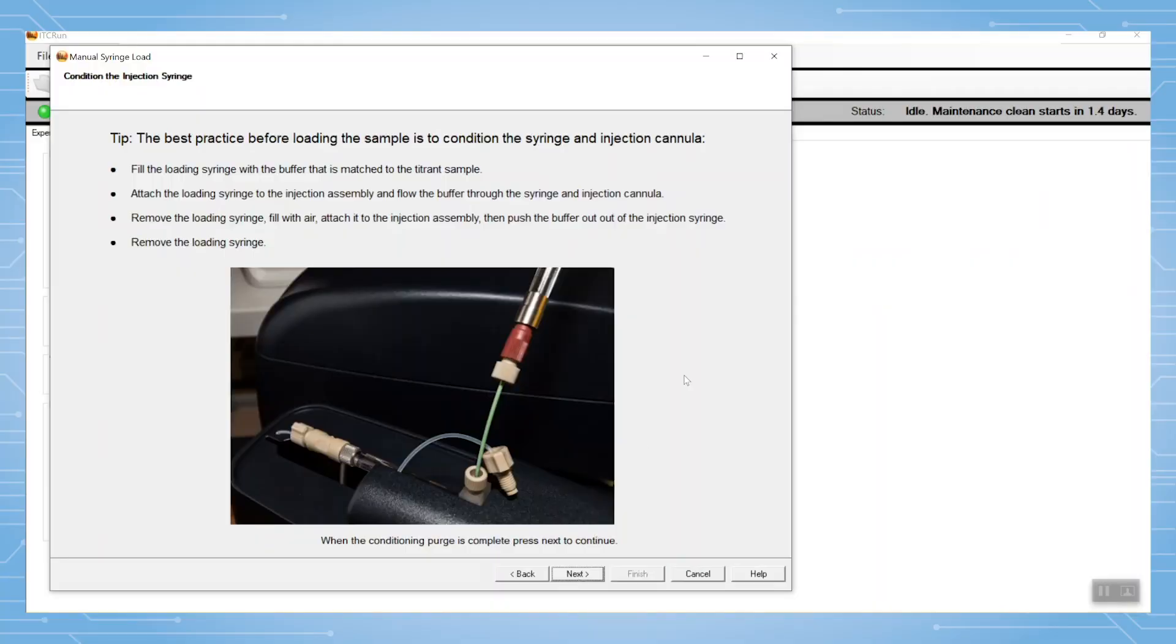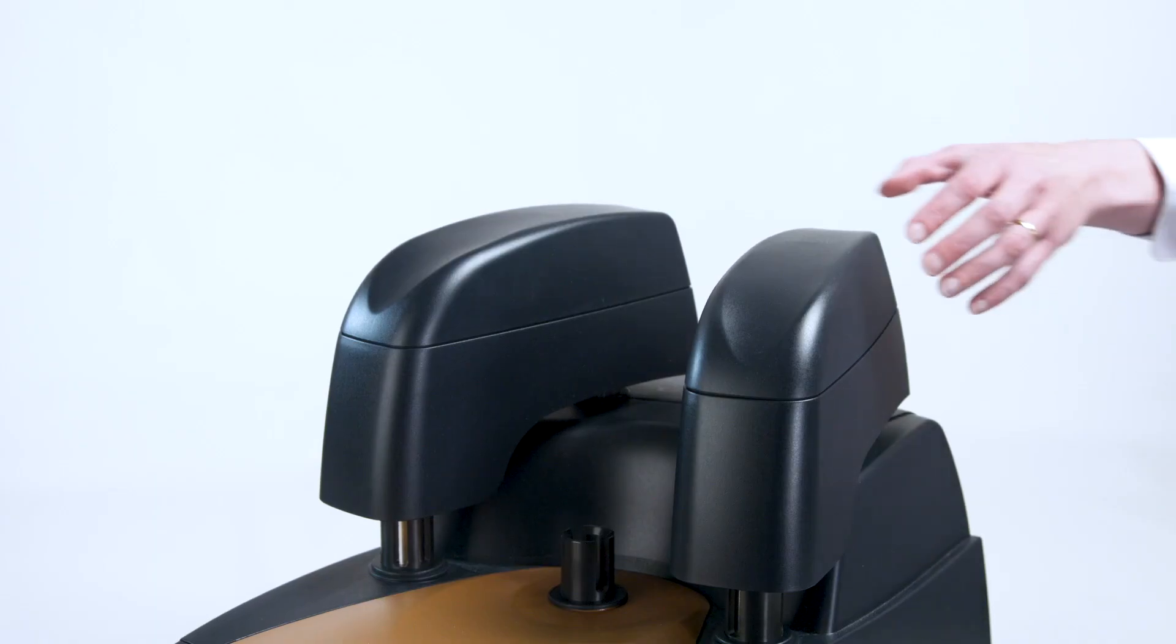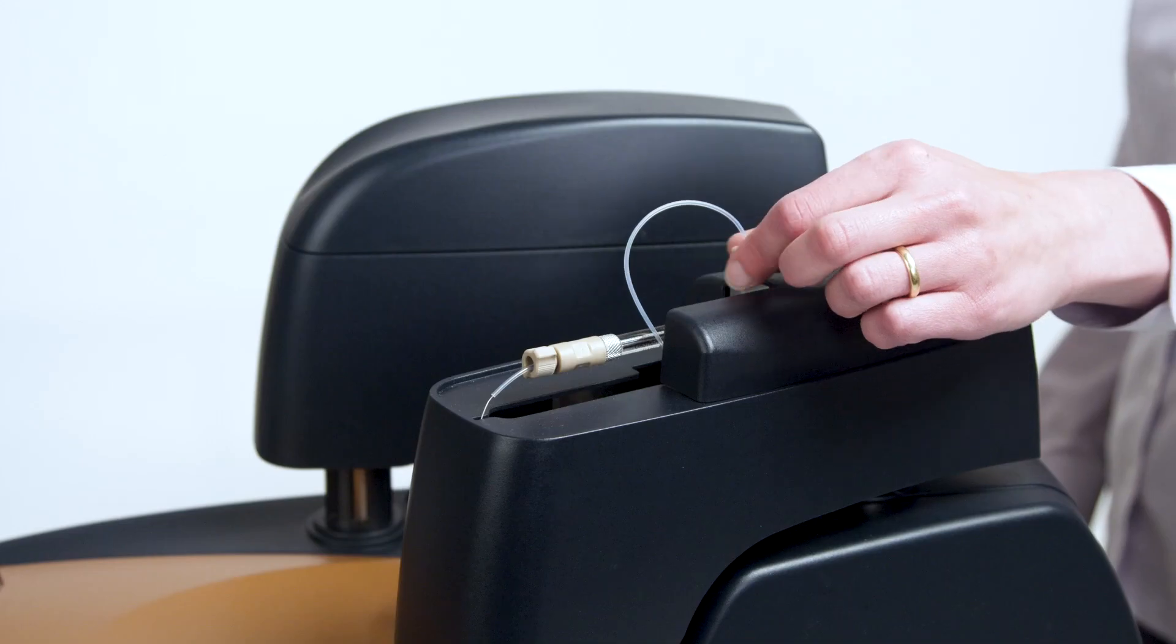When prompted in the software, when the plunger is at the open position and the internal pump is on, load the buffer into the injection syringe to condition the surfaces with buffer.